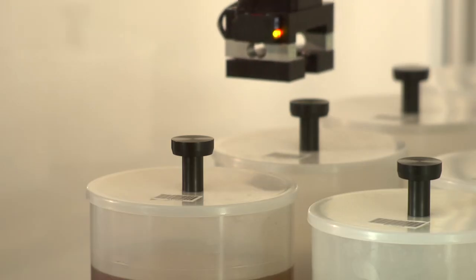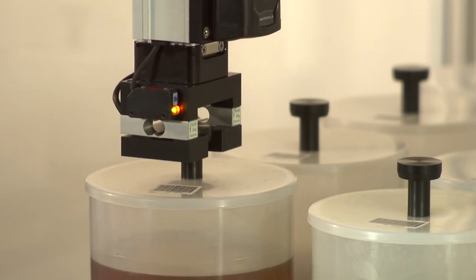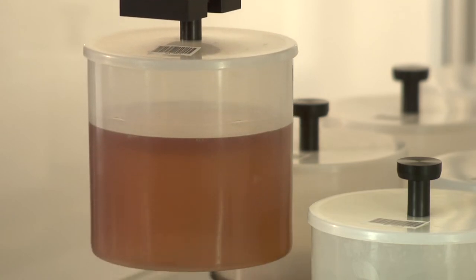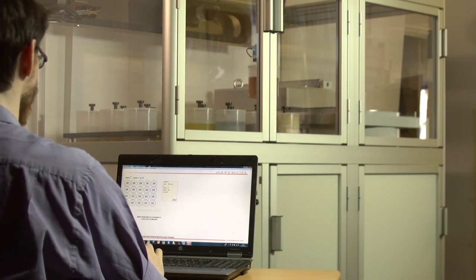The AGSS is designed to use Marinelli beakers ranging in size from ¼ litre up to 2.5 litres. Initially the beakers are placed into specific locations in a rectangular array prior to automatic spectroscopy measurement. Once samples are positioned in the AGSS, the measurement process is completely automated.